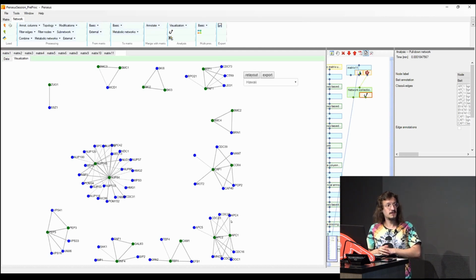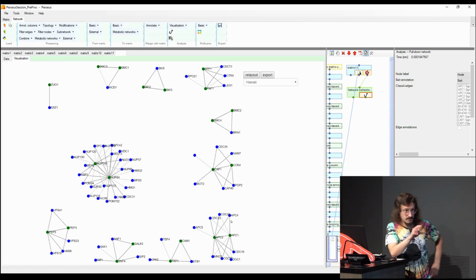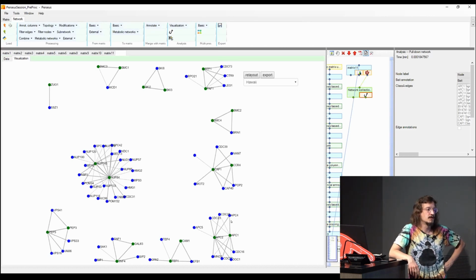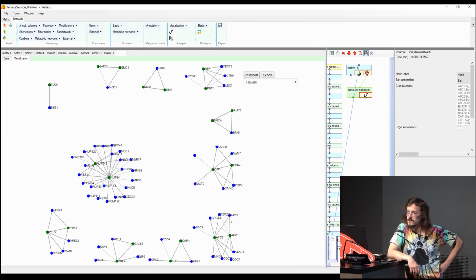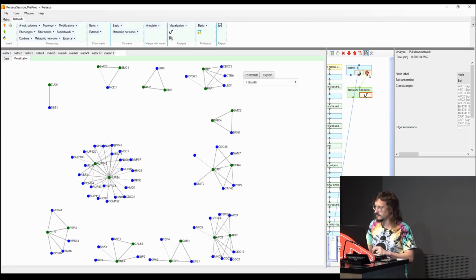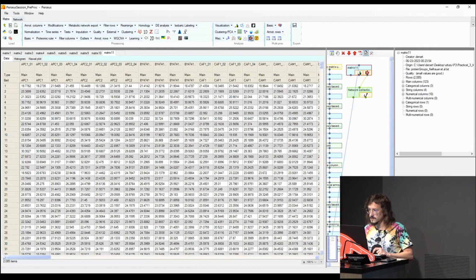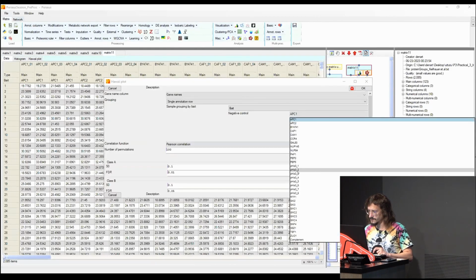And that's something I think is very nice about the study: they checked both things, the complement for everything, but also they plotted against all the histones, and they increased the number of histones, seeing that the significance also increases. I would say that was a nice idea, to increase so much the number of controls that you use. I think in the parameter interface for the Hawaii plot, one can actually set specific control groups, right? So you could tailor your control group.